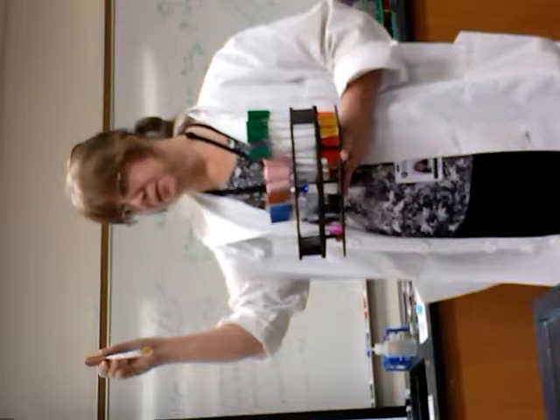SIM: stab it to the bottom. Sulfide, indole, motility. If it turns black, there is positive sulfide production. You know what organism does that. What reagent do you drop on it for the indole part of SIM? Kovac's reagent for indole will give a red ring again at the top.